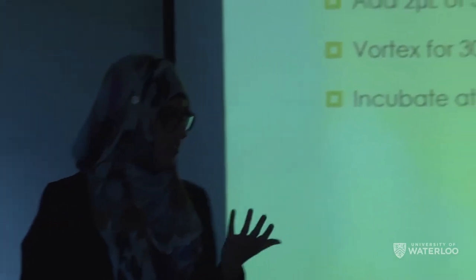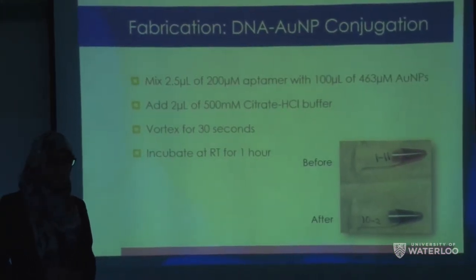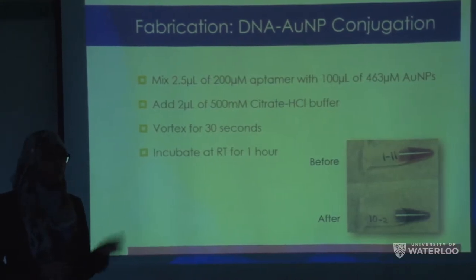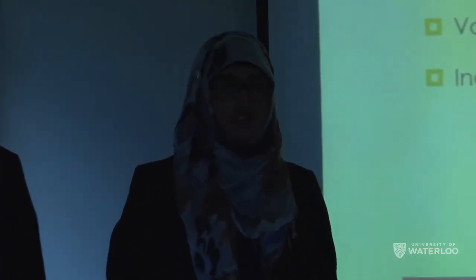So with the theory that you just saw on the last slide, this is our actual application of it in the lab. We made the sensor by mixing 2.5 microliters of our aptamer with 100 microliters of gold nanoparticles. Then to bring the pH down to pH 3 like we needed for the binding, we would add citrate HCl buffer, about 2 microliters of it. Vortex this for about 30 seconds and incubate at room temperature for an hour.